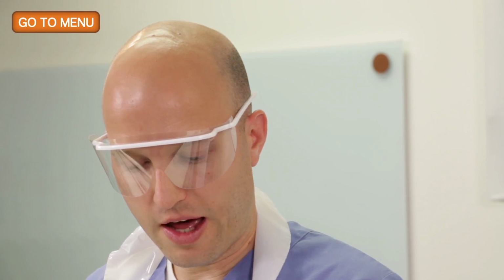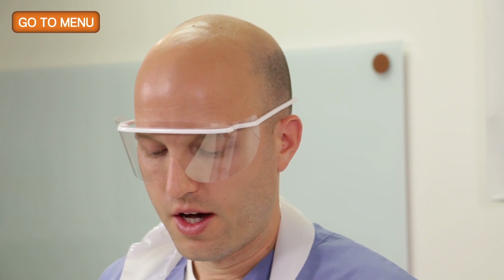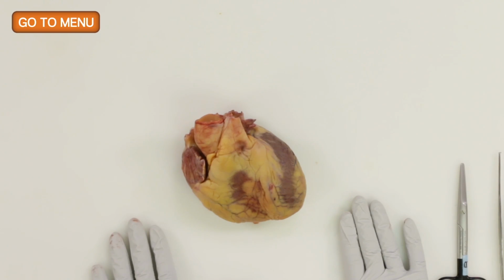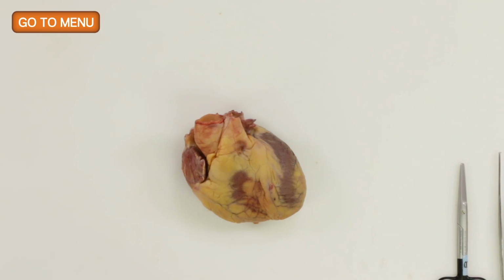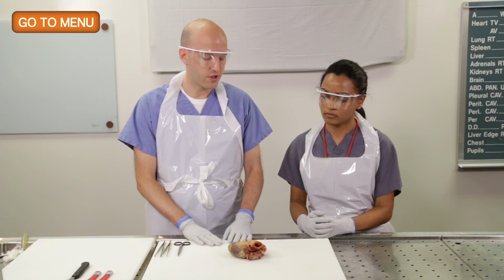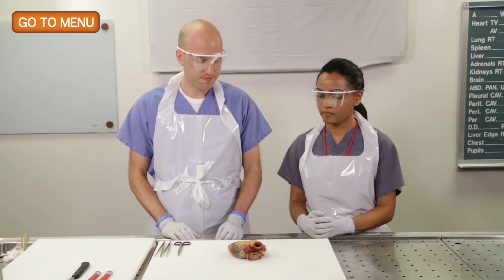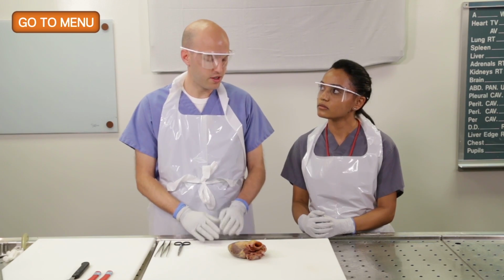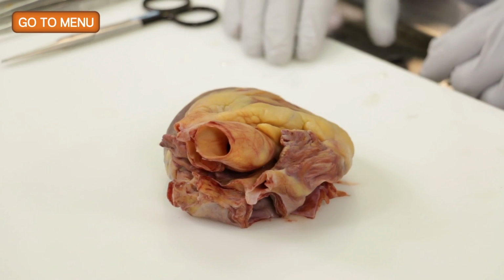All right, very good. So we're going to do the latter of the two methods. And so here we have the heart in anatomic position. I like to always go back to anatomic position. The one tricky thing about the heart dissection is knowing where you are in relation to the ventricles and atria. So to return to anatomic position is always a good idea, and to keep your bearings straight.